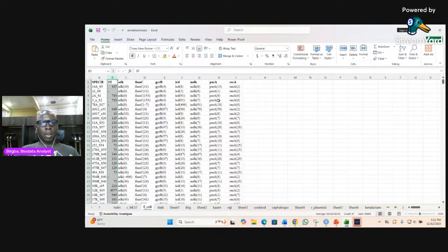When you have it this way, it carries another piece of information. If you have this sample from here, and that sample has the same allele identification numbers in all the 7 housekeeping genes, and then you have another one that has the same, then it means they have some genetic relatedness. And if you understand bioinformatics, you know what I'm talking about. So how do we make sense from it?